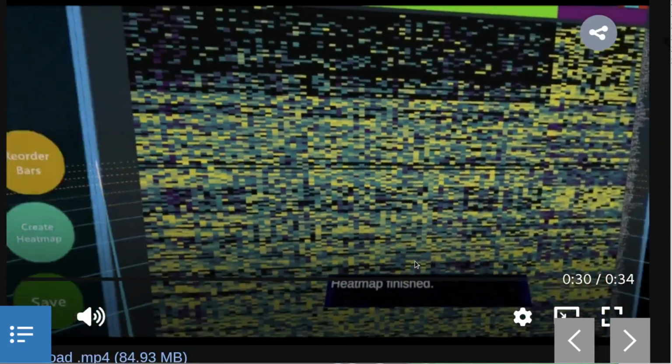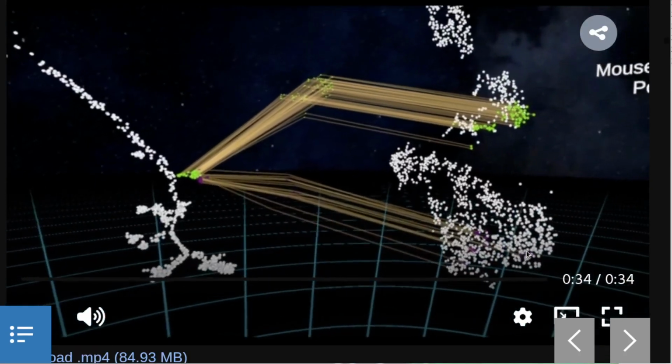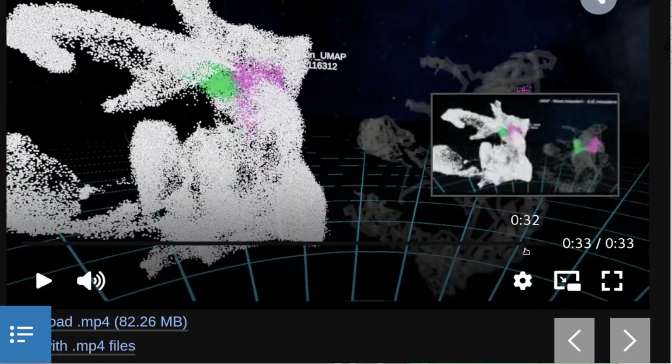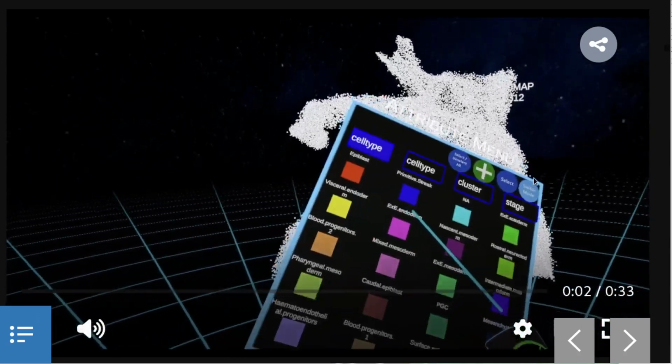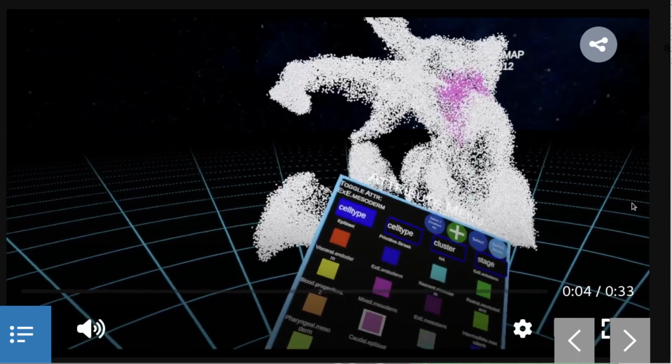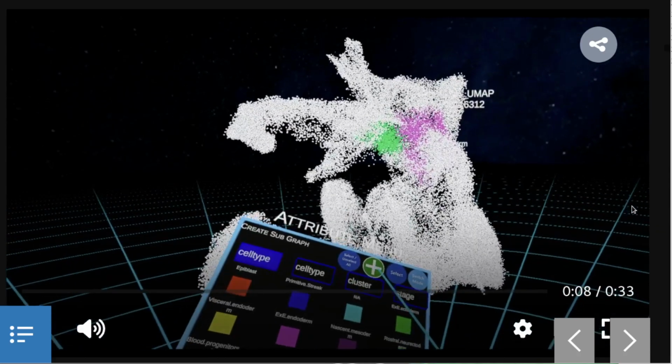Video S3. Coloring cells by attributes, related to Figure 3d. Two cell types have been selected, and for dense DR plots where the interface between selected types is buried, the user has the option to render just these groups in a skeleton of the total data to show their relative position.